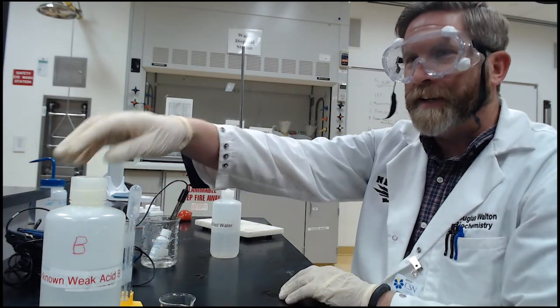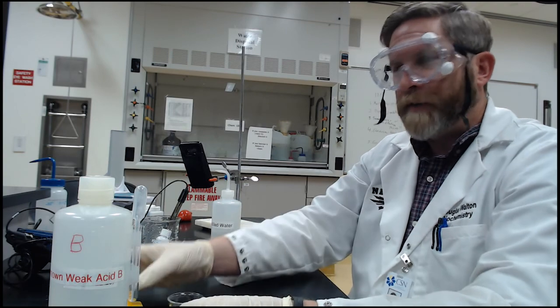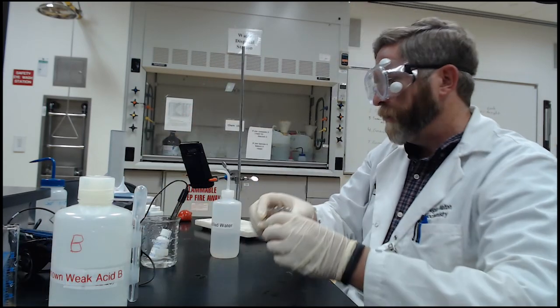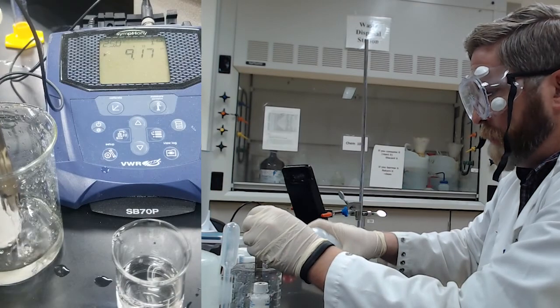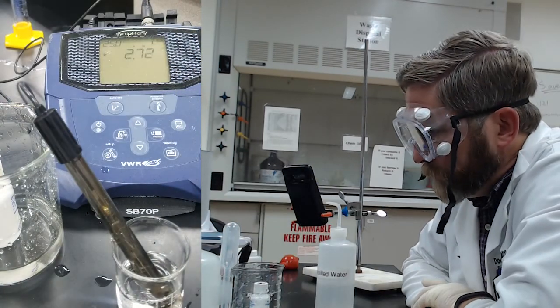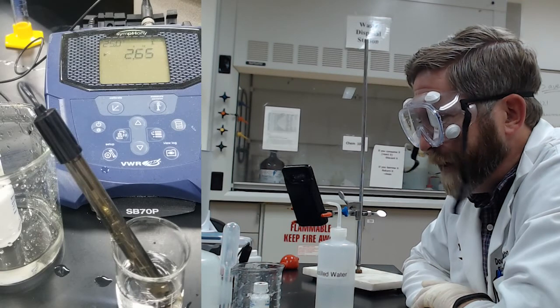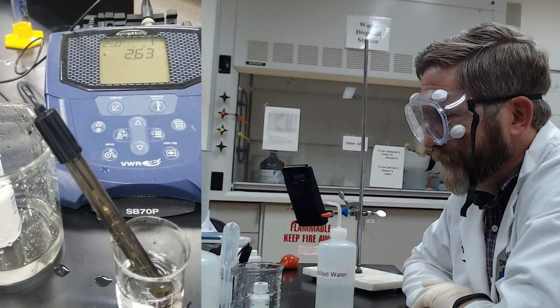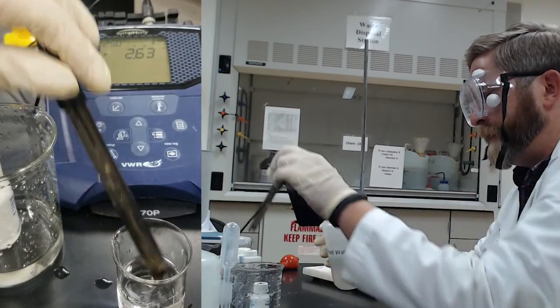Part C — we're looking at an unknown weak acid, labeled B. It's already in a graduated cylinder at 25 mL. We read the pH the same way as all other samples. Based on the result, you may be able to determine what the weak acid is. The smell gives it away here, but since you're not present you only have the numbers — which is how it should be. That's your number for your unknown weak acid, concluding data collection for part C.